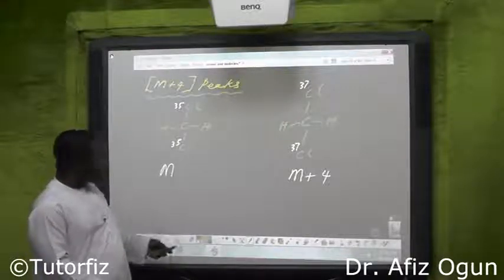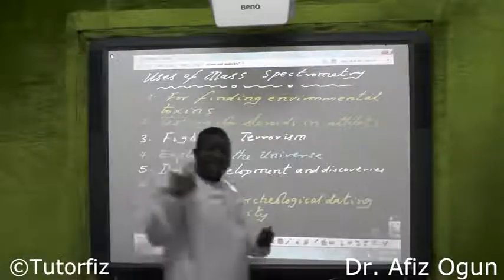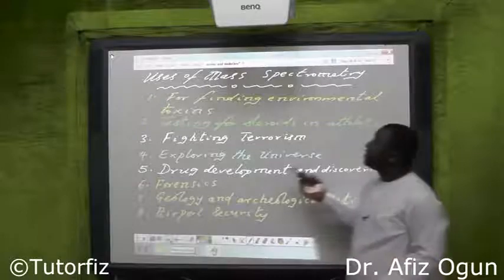So we are going to stop there. I don't want to confuse you further. But before we go, let's look briefly at this list, the uses of mass spectrometry.